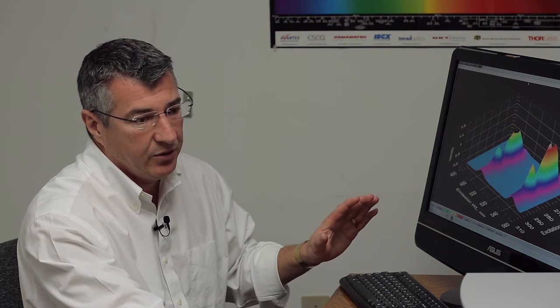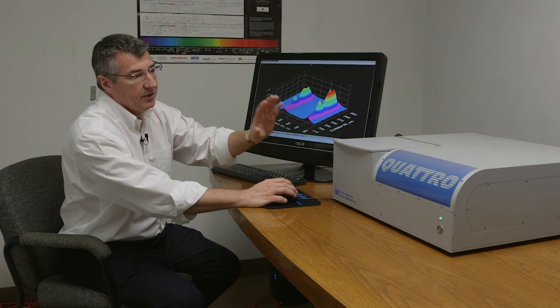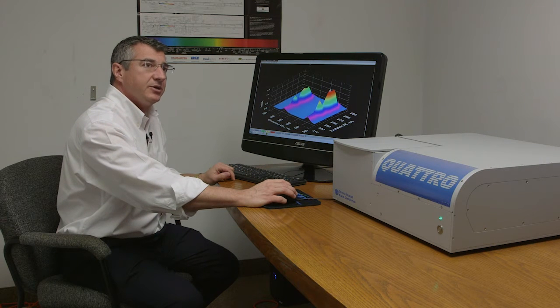This is our Quattro software. It's a very powerful, simple, easy to use software, very complete and we're going to show you how we can collect data with the Quattro and analyze it as well.